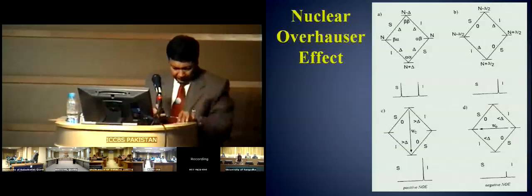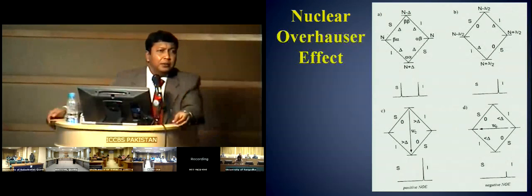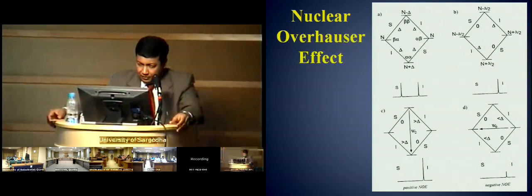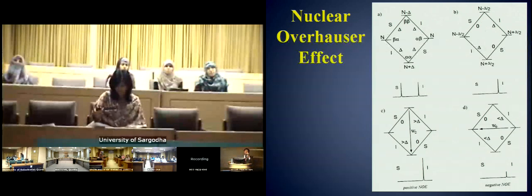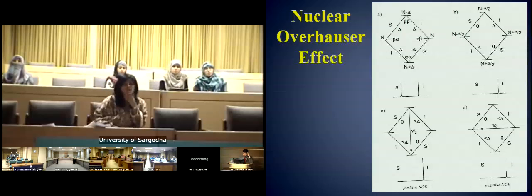Excuse me, sir. Yes? So I was having some questions regarding inverse NMR. Sure, please, go ahead. Actually I joined late and maybe I am asking the same thing which you have already explained, but sorry. No, please go ahead. So the first thing is that in inverse NMR we observe proton with C13. So what happened with the proton with C12 relationship?